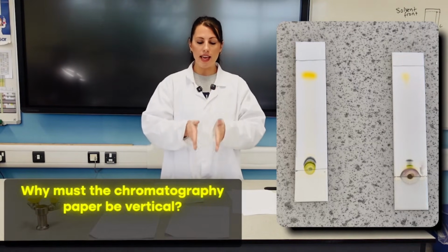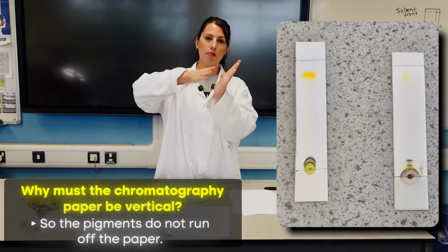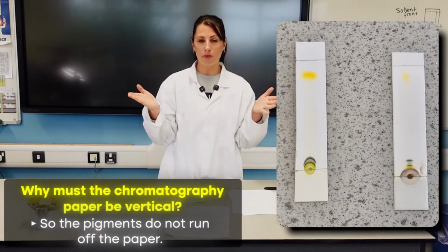They need to make sure that their TLC paper is straight and not at an angle, because otherwise as the pigments move up, they might go off the edge of the paper. Another common exam question is that one.